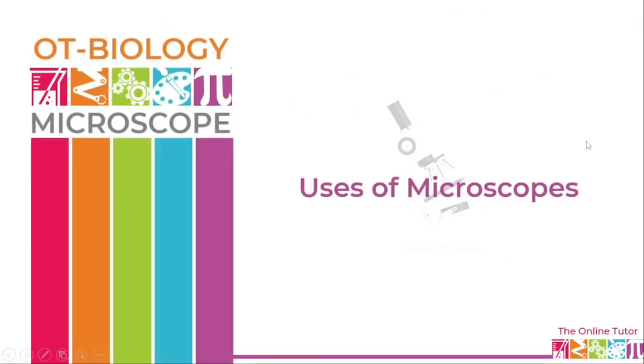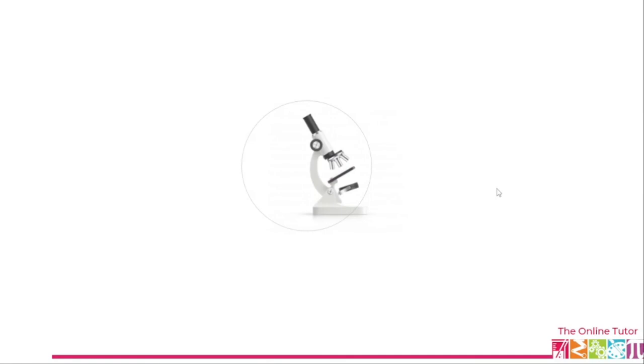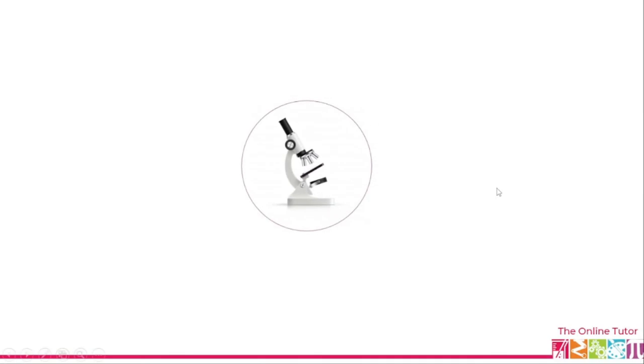Now let's talk about the uses of microscopes. Before we talk about the uses, I want to state that we are not just talking about the uses of the optical microscope, we are talking about a combination of uses of the microscopes in general. So even though I'm going to be using the optical microscope as the image in that slide, it doesn't mean those are the uses of just the optical microscope, but it is the uses of all the microscopes together. All right, so let's have a look at the uses of the microscopes that we have.